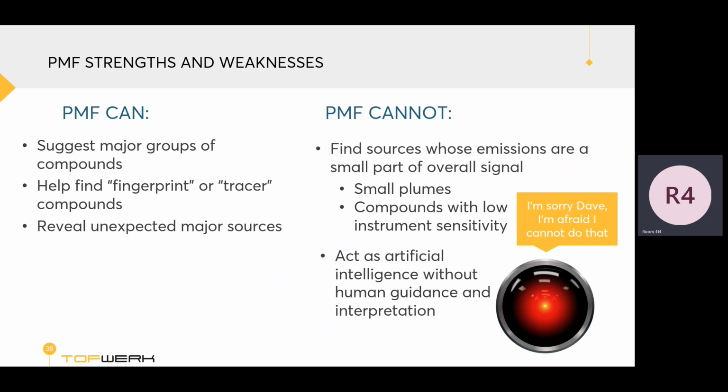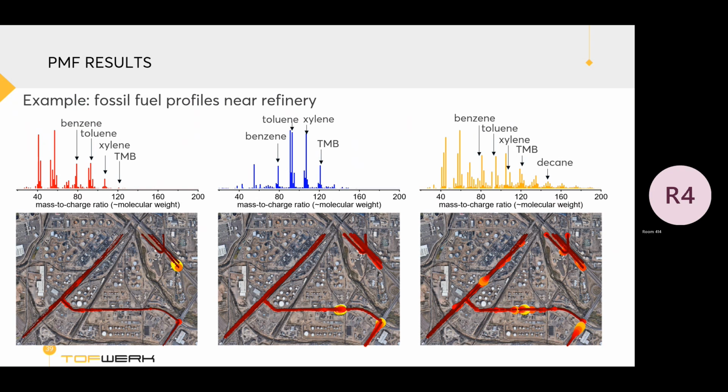So let's look at an example of PMF results. We restricted the data to the area just around a refinery.